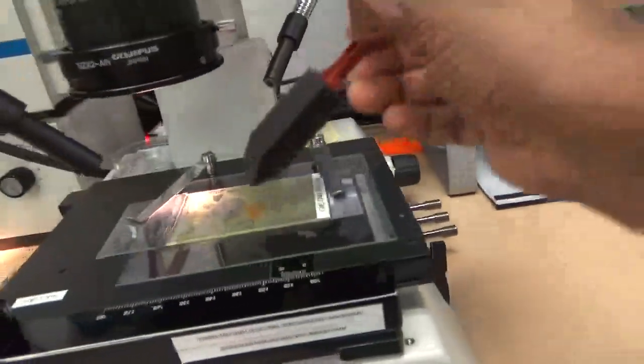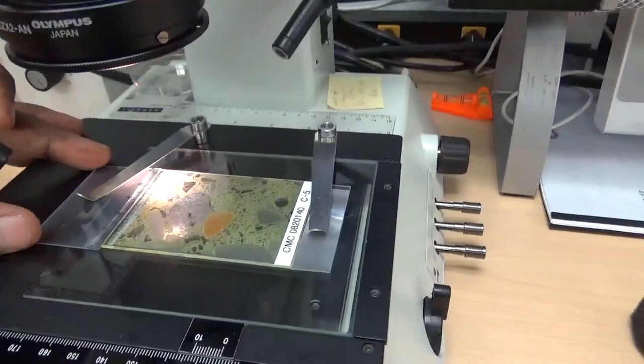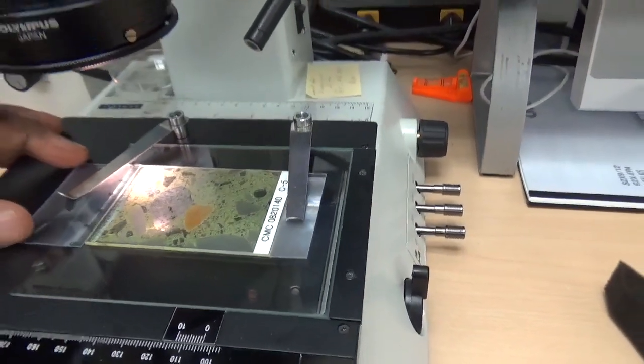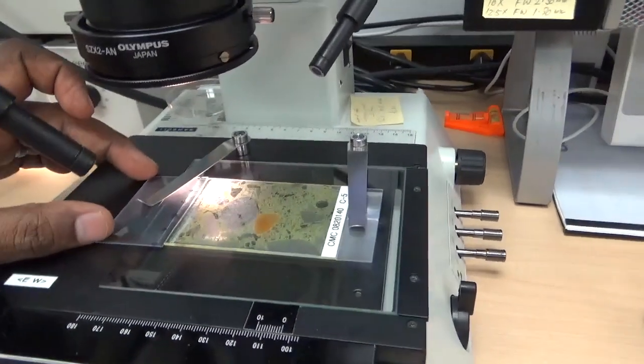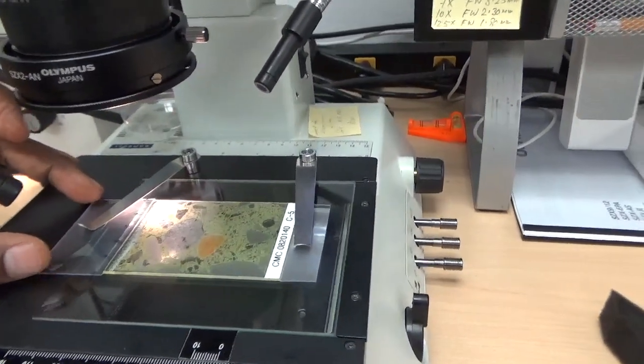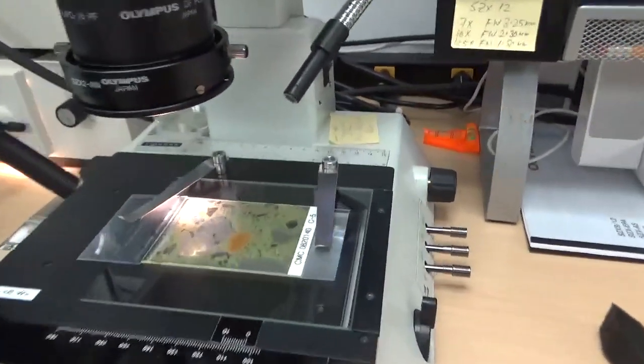Okay, so I start with the edge. I use a thin film of oil on the thin section. I don't put a cover slip since I do SEM work after optical. I keep the thin section uncovered. I put a thin film of refractive index oil.